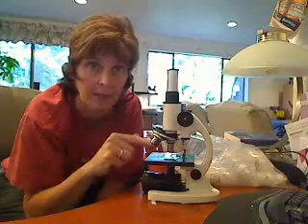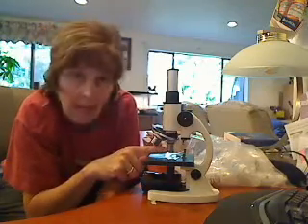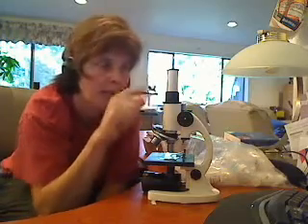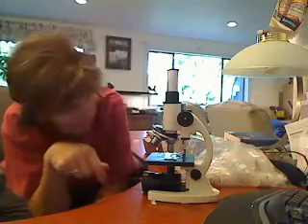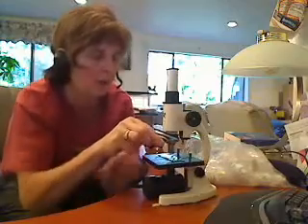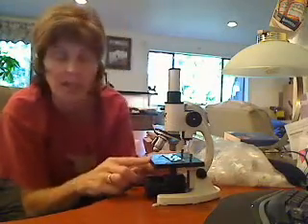Down here we have our objective lenses. You look at the side of them: this one says 4, this one says 10, and this one says 40. To calculate magnification on a microscope, you multiply the top by the objective. So 4 times 10 — that would be 40. You always want to start on the lowest magnification with the stage down.